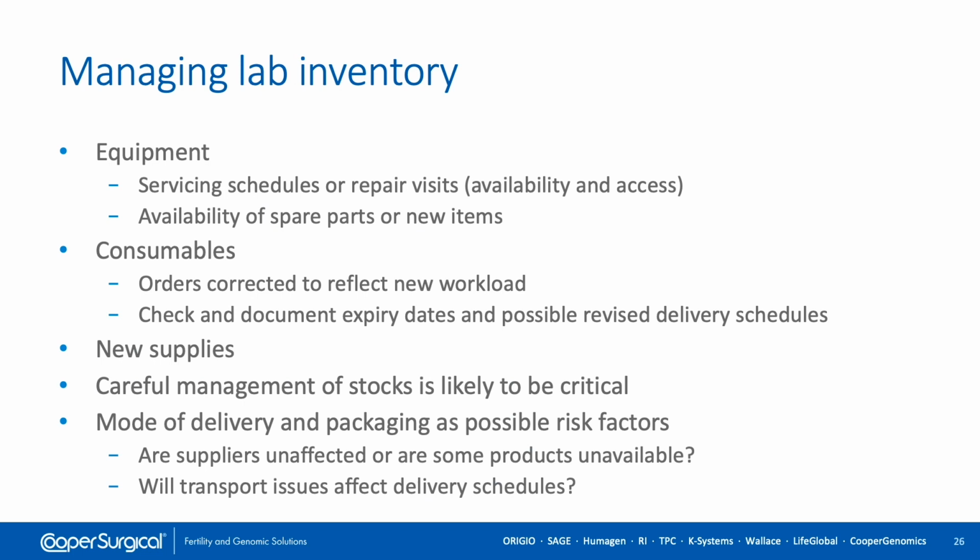Preparation of the laboratory must also include management of resources in addition to personnel. Access for servicing and repairs needs to be reviewed, along with the availability of spare parts and consumables. Workload, delivery schedules, and transport logistics may all impact upon this, so careful management is likely to be critical.